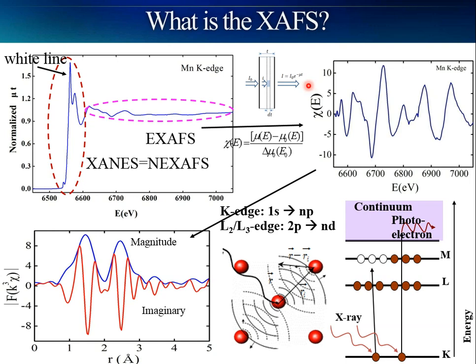Right? So we took the intensity of incident X-ray, I naught, and then we found the total absorption mu T. Okay.